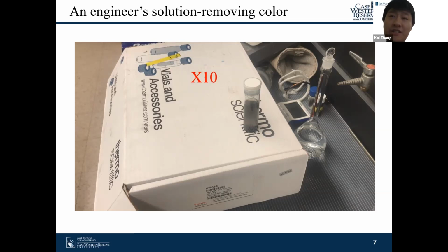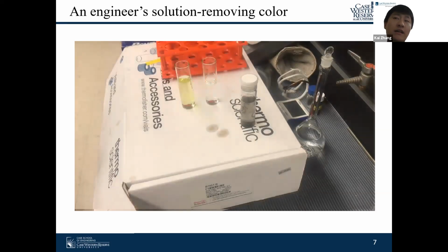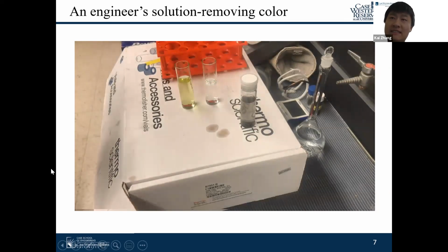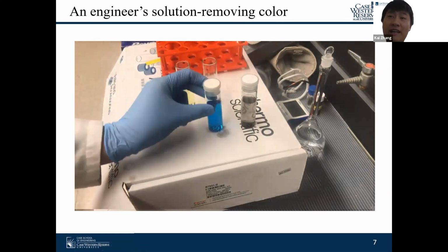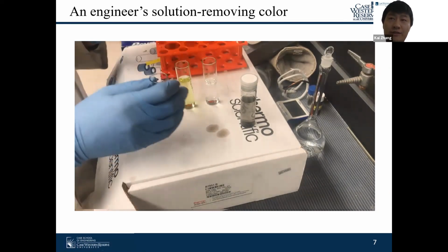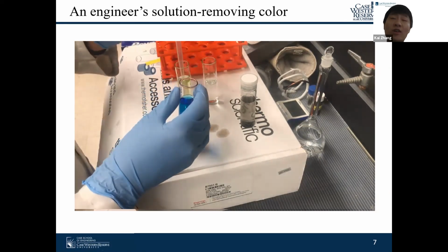The environmental engineer also had a second solution, a chemical-based method. Let's see how it works. We still have the same simulated colored water, and it's also very simple.